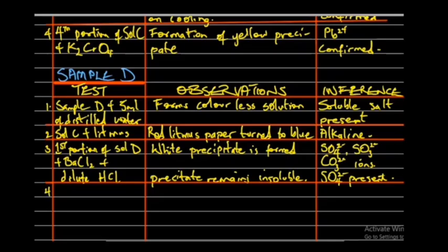This time around, we reversed the process of number 3. The second portion of solution D plus dilute HCl first. When we did that, we discovered that there was no visible reaction.